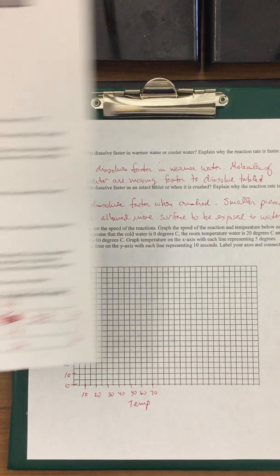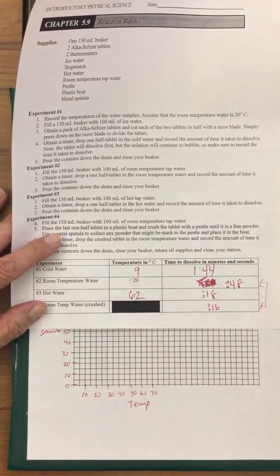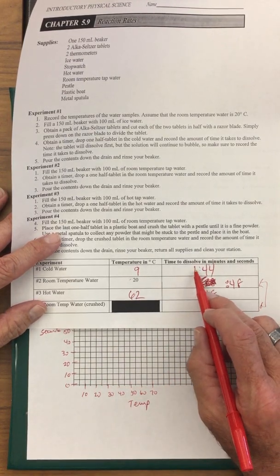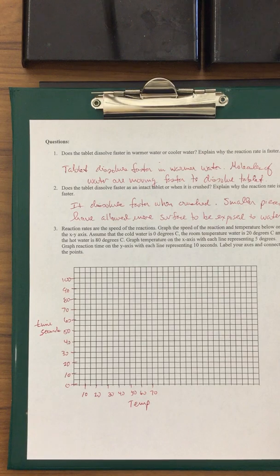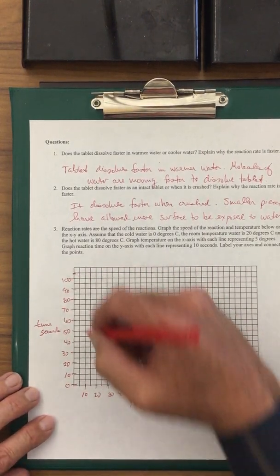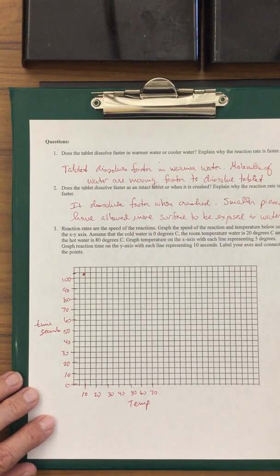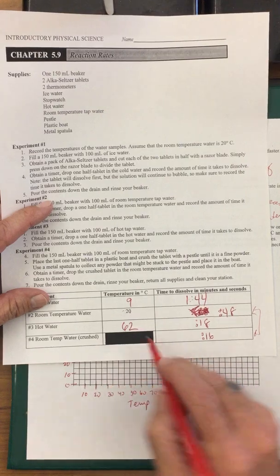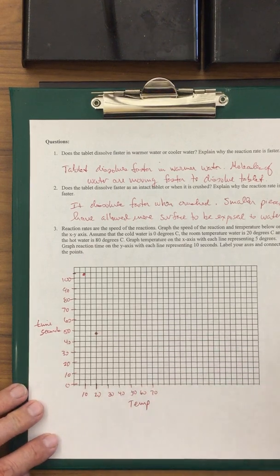So now we're going to be graphing this data that we have right here. The cold water was close to 10 degrees, so it's 9 degrees, and it's 1 minute and 44 seconds. Well, if a minute is 60 seconds, 60 plus 44 would give me 104 seconds. So it's close to being right about here, 9 degrees and 104 seconds. Room temperature was 20 degrees, so we're right about here, and we're going up to 48 seconds, so almost up to 50.